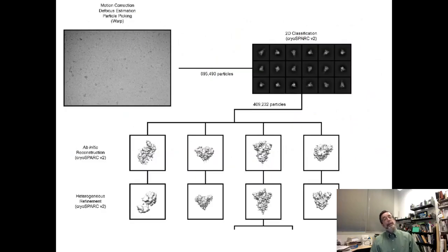This is a particular picture from the supplementals, but it's nice because it shows the different steps of cryo-EM. You don't need to know all the technical details, but you need to know how this fits with how we described it in class. You have all the different 2D images, and you put them together into a reconstructed 3D image.